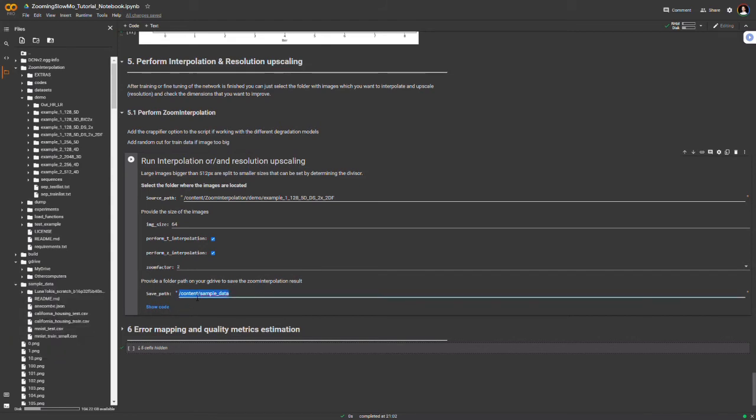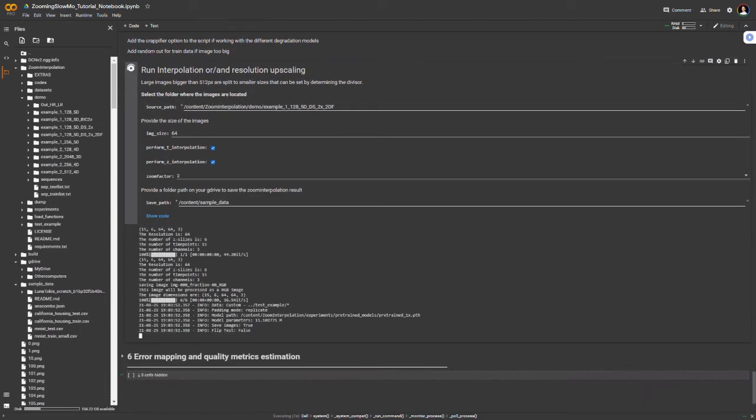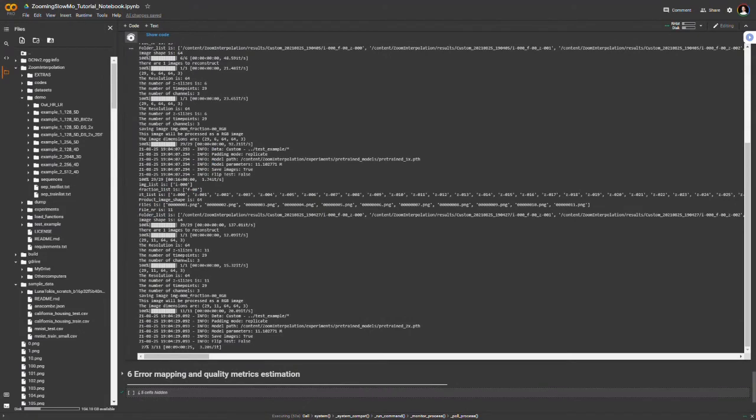It can be downloaded from the files, or if saved on your Google Drive, it can be downloaded from your browser. In ImageJ, the dimensions can be reordered to get the enhanced image.